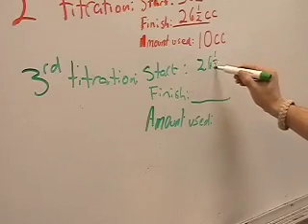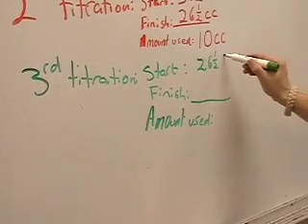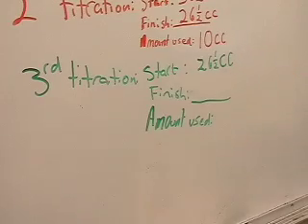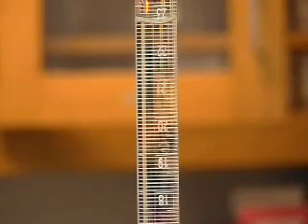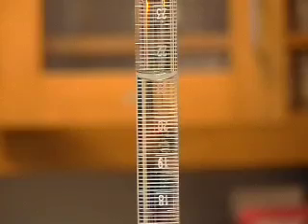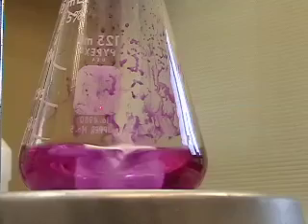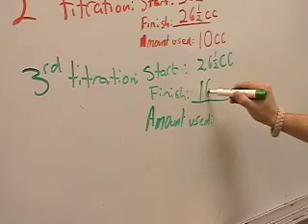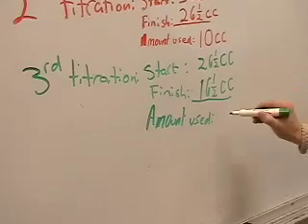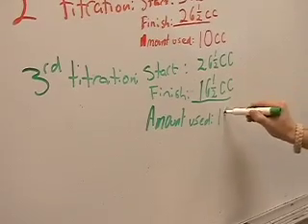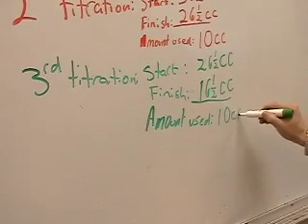For our final titration, we start with 26 and a half cc's of acid in the burette. After dripping some into the flask, we get 16 and a half cc's of acid left in the burette after neutralization occurred.